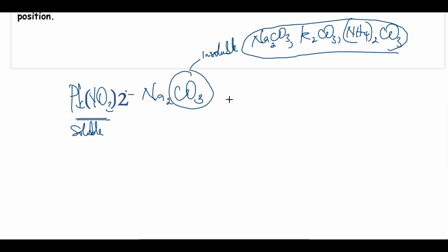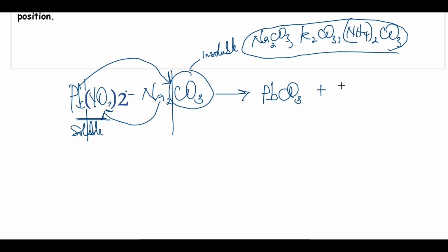So when you mix these two salts together in an aqueous solution, you will have lead carbonate and sodium nitrate.